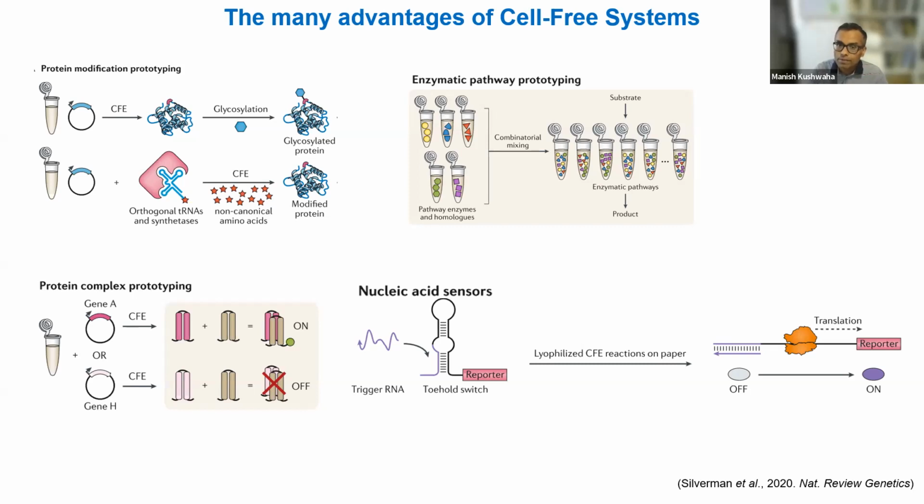So there's a lot of things that you can do with cell-free systems for prototyping, but of course now cell-free is also being expanded to do more with it, which is more biomanufacturing, producing personalized medicine. So you want to produce specific compounds at small scale. You can use cell-free for that. And those are some of the future avenues that I think cell-free has a lot of promise for.